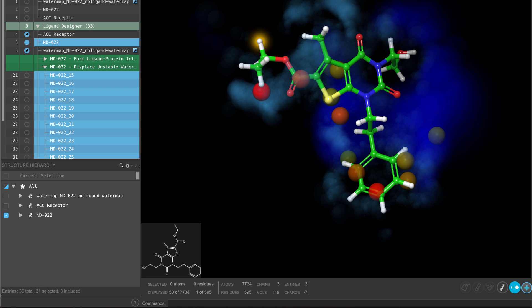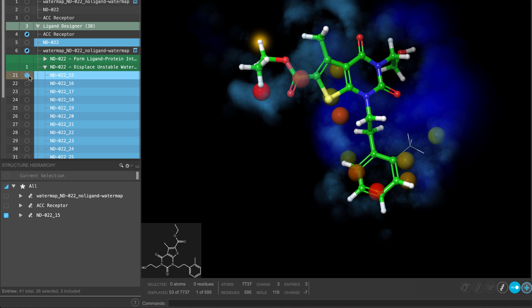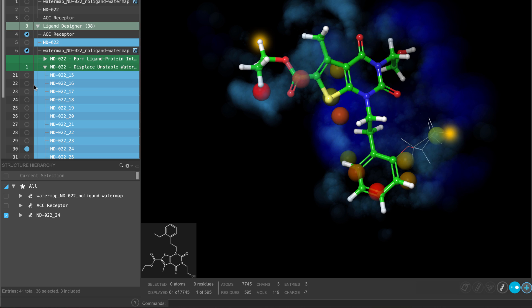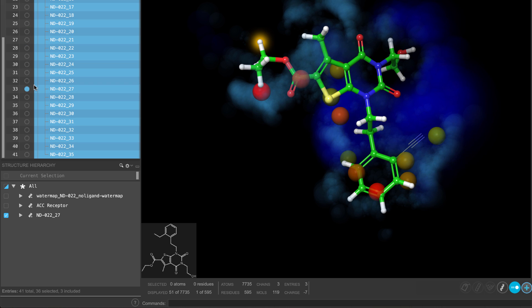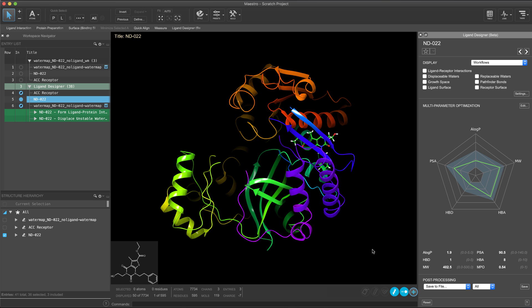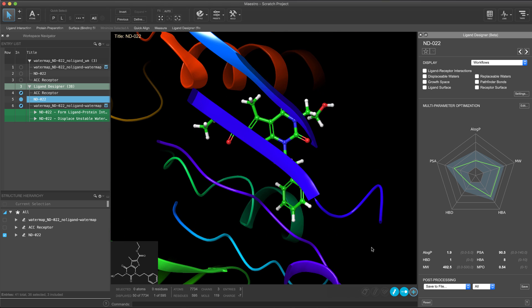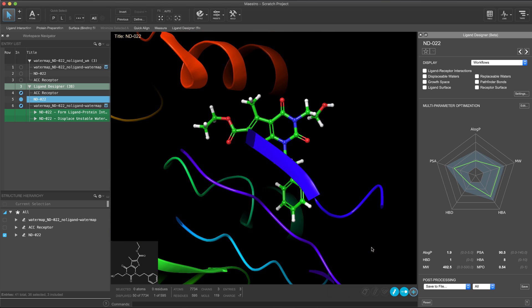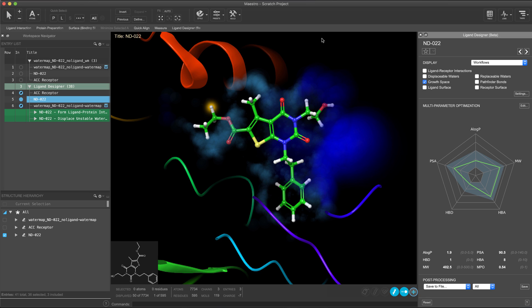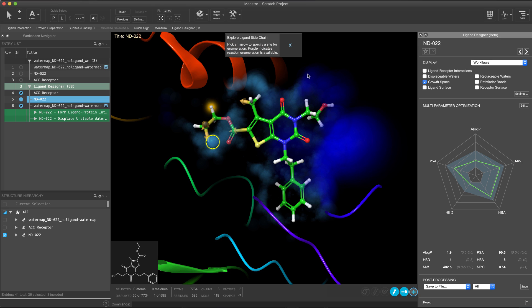As each new enumeration is docked, the results will appear in the project. In the case of growing into a cavity, the process is similar. Display the growth space and click on the volume within the cavity to initiate the workflow.